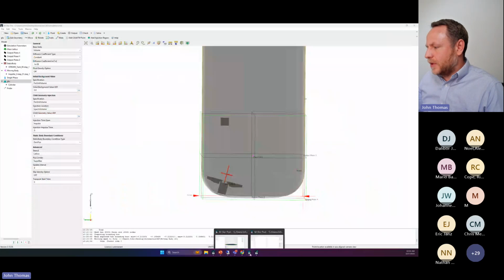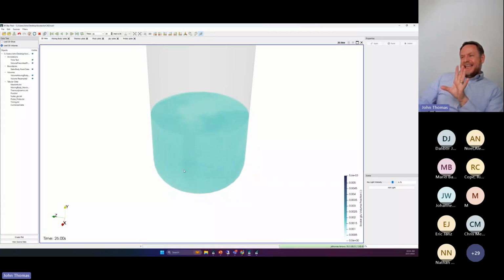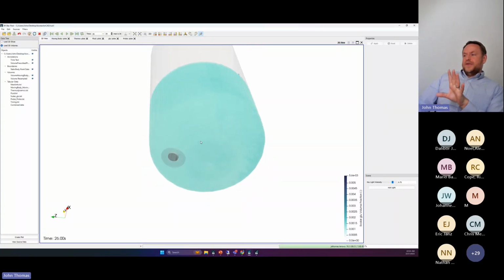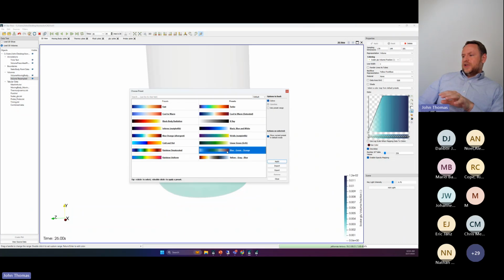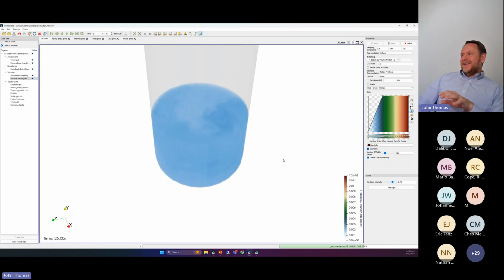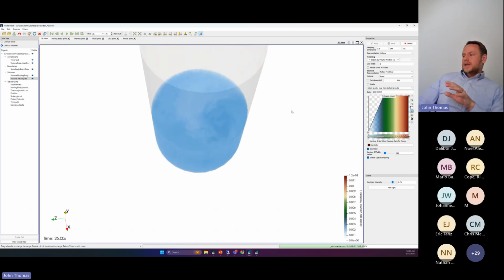So again, we'll let this come to fruition and let it blend. It's almost done. I'll stop here soon because once you get to 90%, it gets hard to see. There are still differences, but they get a little trickier to see. Let me change the color scale here so I can anticipate them some. They're there-ish, but it's hard to see at 90% homogenized, but the math can pick it up. You can see a little bit there.